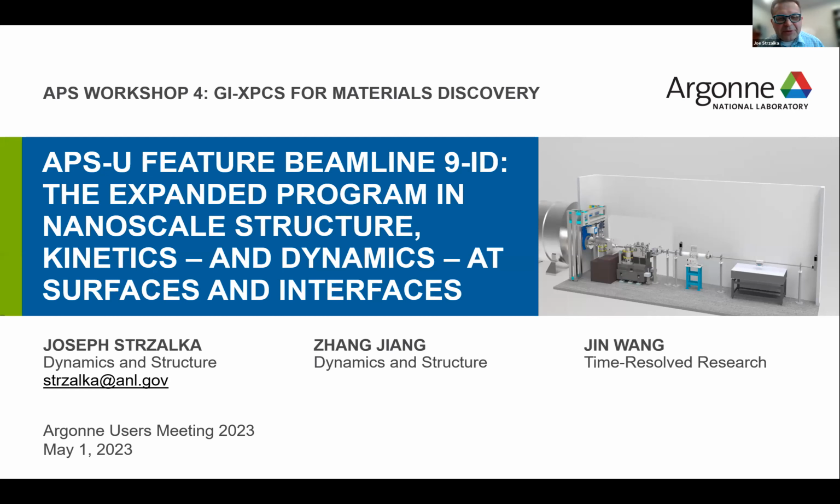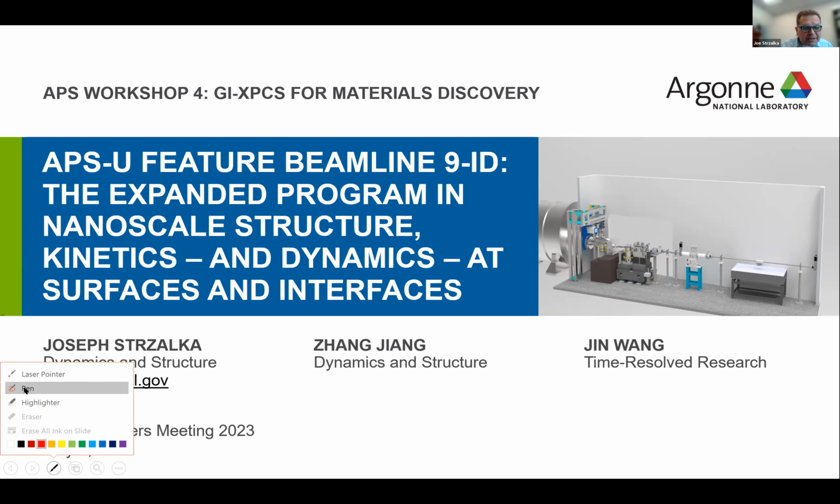I'd like to give you an overview of our new beamline at 9ID, after that great intro from Jin and from Sunny setting the stage for GI-XPCS studies. I'm very happy to have been working to bring the new beamline at 9ID into reality, together with the co-scientific leads on the project, my colleagues Zhang and Jin.